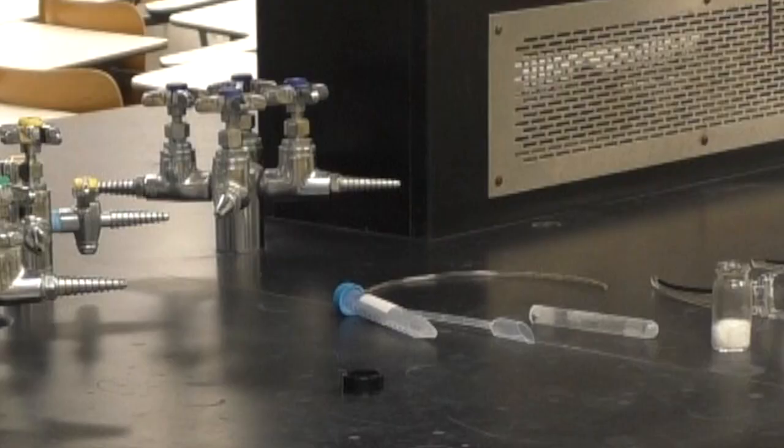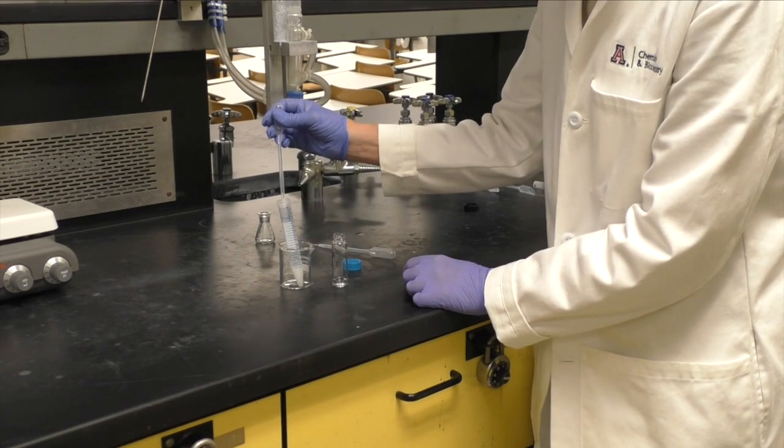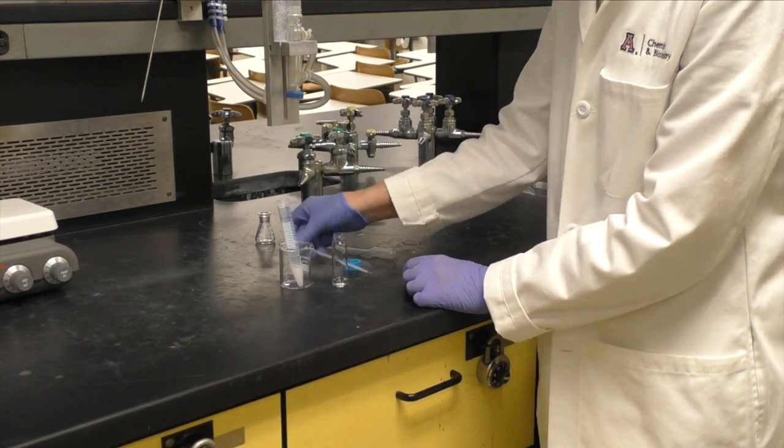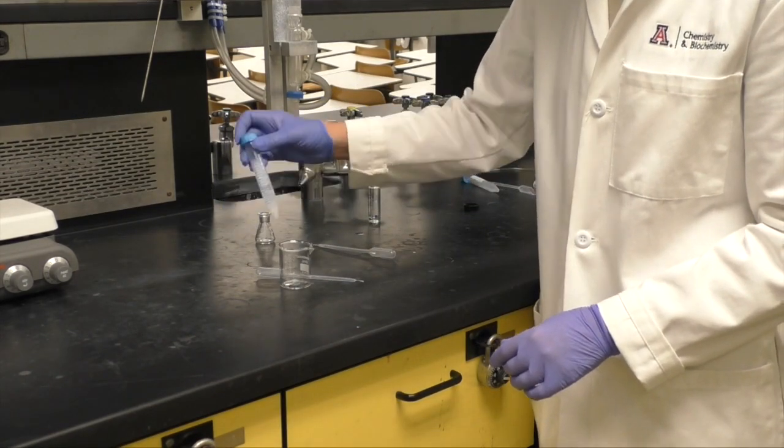Cap the tube you just removed the layer from and lay it aside. Add another 1.5 milliliters of water to the organic layer. Shake that tube well and again allow the layers to separate.